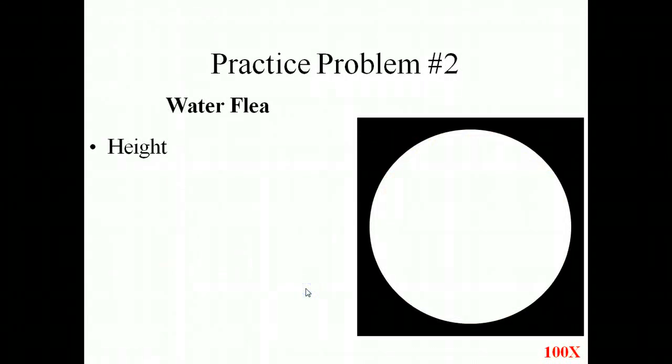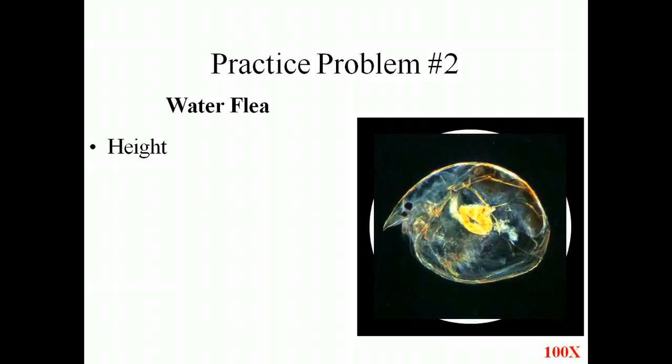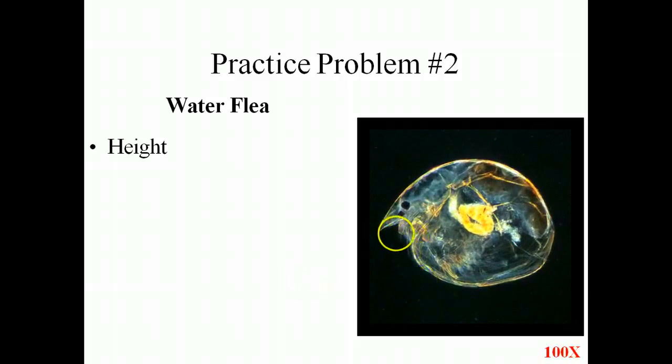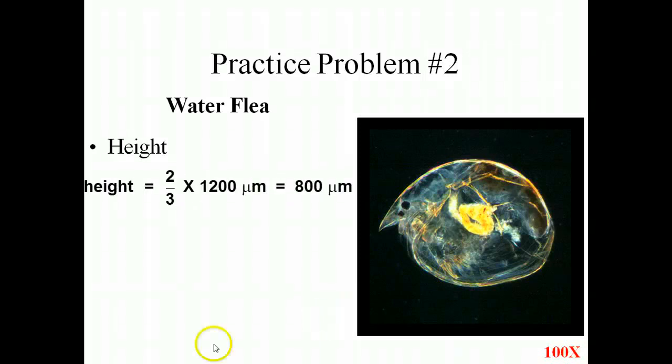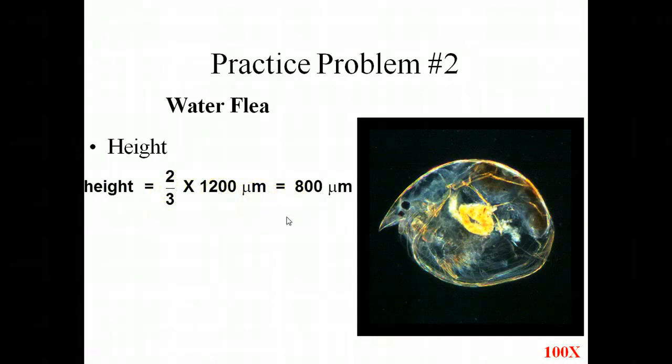Here is the water fleas. If we were to estimate the height of a water flea, height is going to be from the top to the bottom of this little flea. I would estimate that it takes up about two-thirds of my field of view. We're under low magnification, which is 1,200 micrometers. So two-thirds times 1,200 gives us an estimated size of 800 micrometers tall.